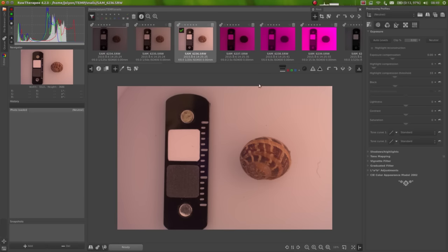This histogram looks quite good, and you'll notice as I move my mouse around there are little bars under the histogram that show you the red, green and blue values under the pointer at that moment. So under the white standard here the values are high, and under the grey standard the values are low, and on the black very low. This image looks fairly well exposed. Notice that the histogram is covering pretty much the whole range, but there's no clustering at the top here.